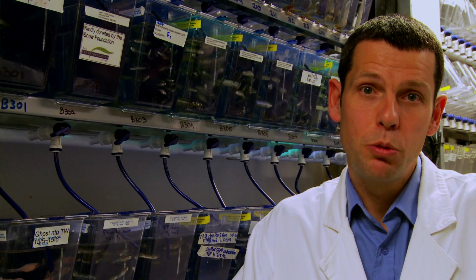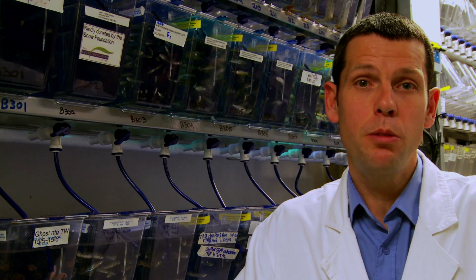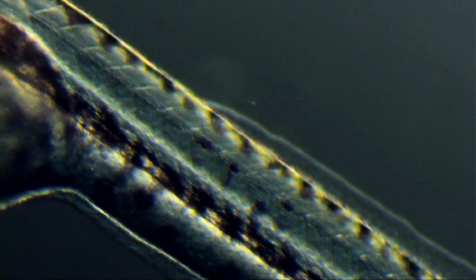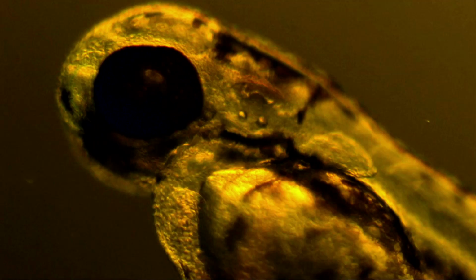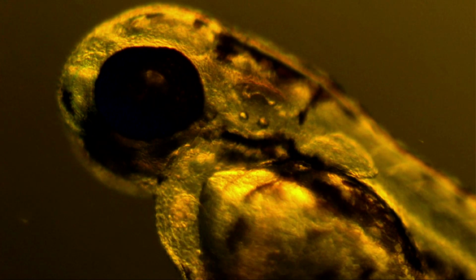Our other specialised equipment includes microscopes, so we have microscopes with fluorescent lamps on them, and this allows us to see different fluorophores, so very bright red, green, blue marker proteins. So in real time in a living fish we're able to tag a protein with a fluorescent marker, and this allows us to see what that protein does, when it's made and where it goes. So for example, we have fish which express green, blue and red fluorescence in different proteins all in the same fish at the same time while the fish is alive.